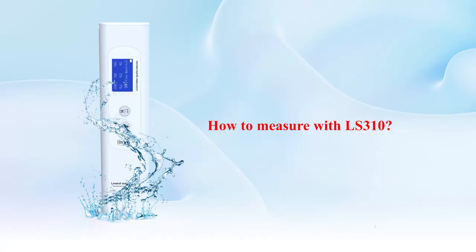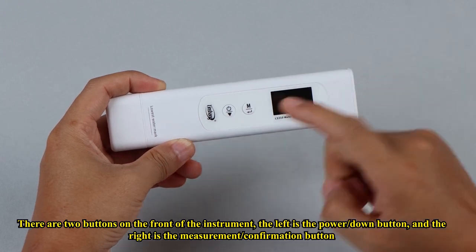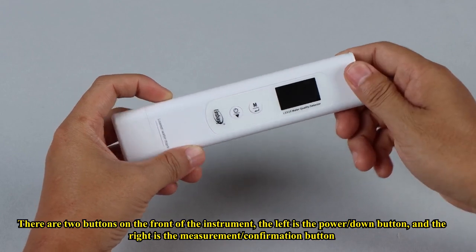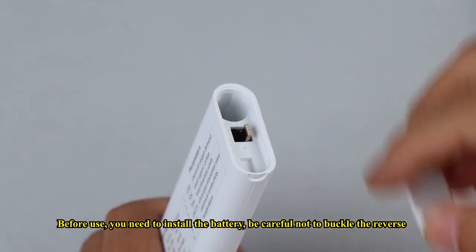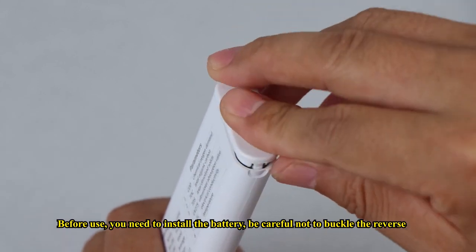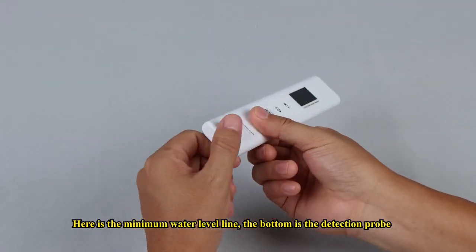How to measure with LS310? There are two buttons on the front of the instrument: the left is the power or down button, and the right is the measurement or confirm button. Before use, you need to install the battery — be careful not to insert it in reverse. The minimum water level line is marked on the device, and the bottom is the detection probe.